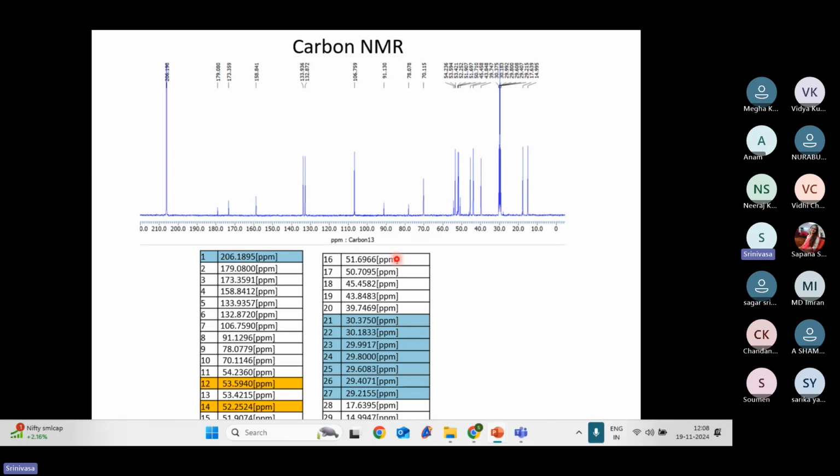Okay. So that is very clear. It's the acetone signal of the solvent. You can see acetone signal, one here, one here. Now there may be small peaks at this point. This may be impurities, I can consider. So how did I conclude that as impurities? Because comparing to the other peak intensities, this intensity is a drastic difference, a large difference. It's very clear that this may be some different molecule.